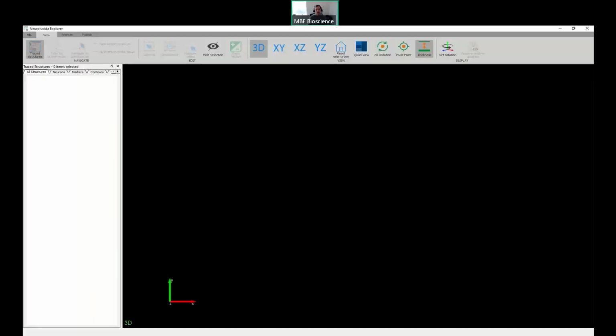The first thing that I want to do is just jump in and show the Neurolucida Explorer page at its default. This is what you'll see when you open it up. To start, I had a couple of questions that I wanted to give to you guys that usually come in from the free trial process and for new users.